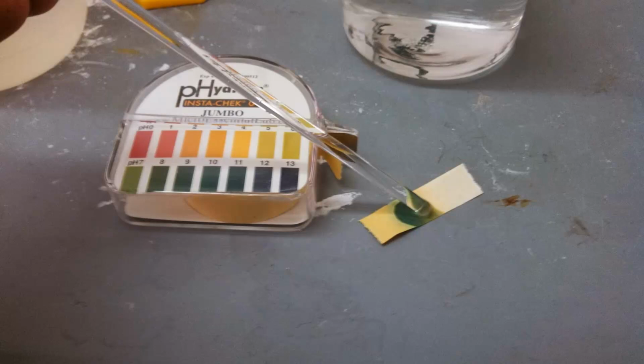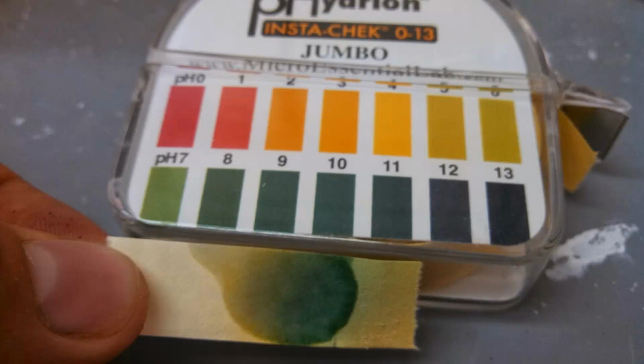You dip your stirring rod into the solution, touch it to the pH paper, and then read the pH while it's still wet, right away. The color will change over time.